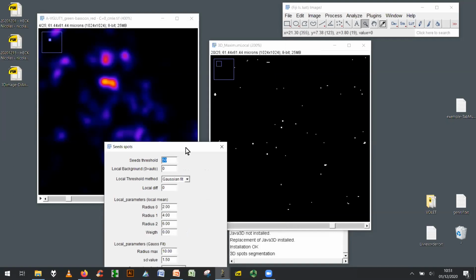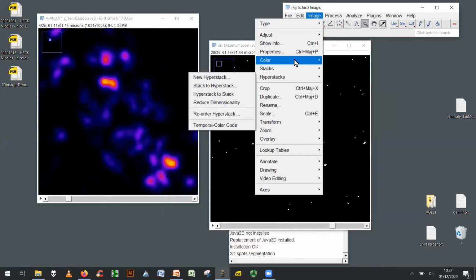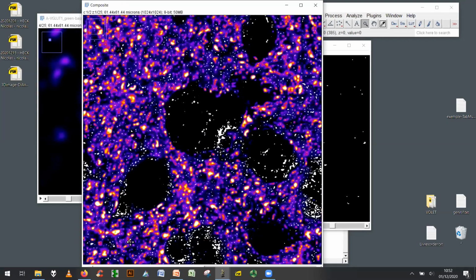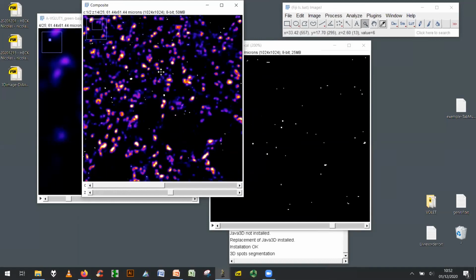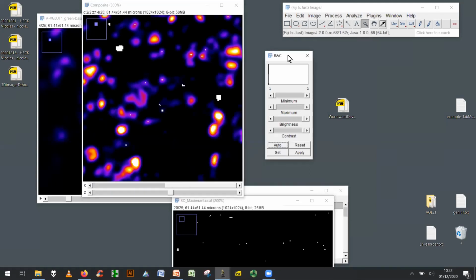That is the question. Of course, as I told you, if we merge the channels, we'll obviously have some spots which are not at all in objects, simply because they're in the background, right?